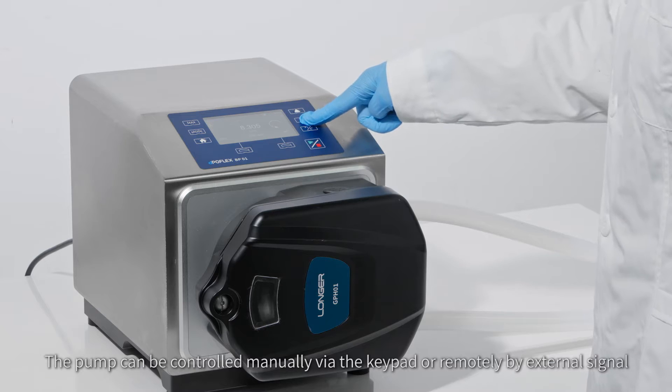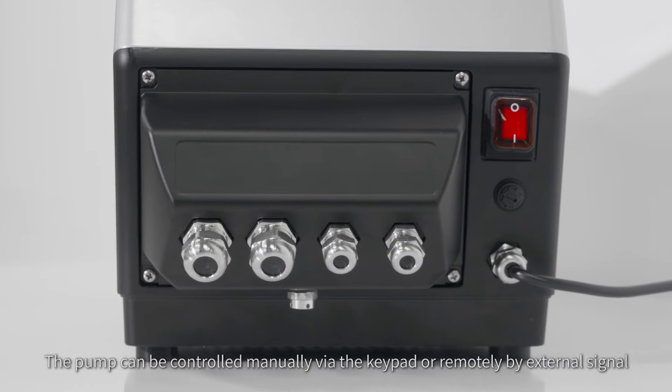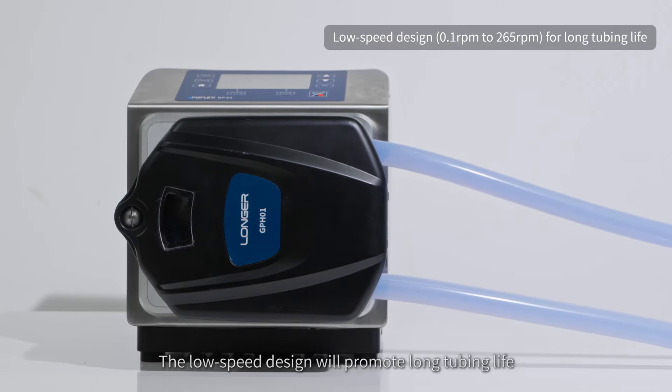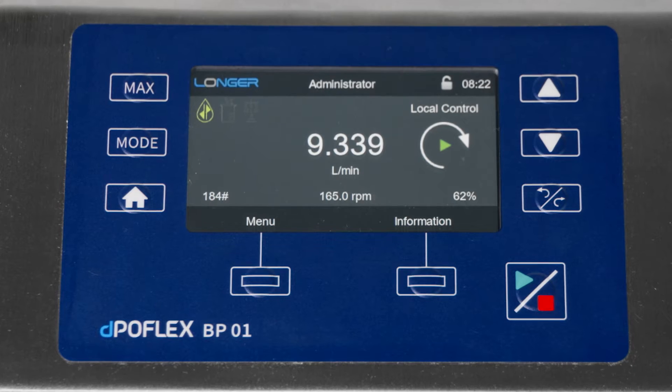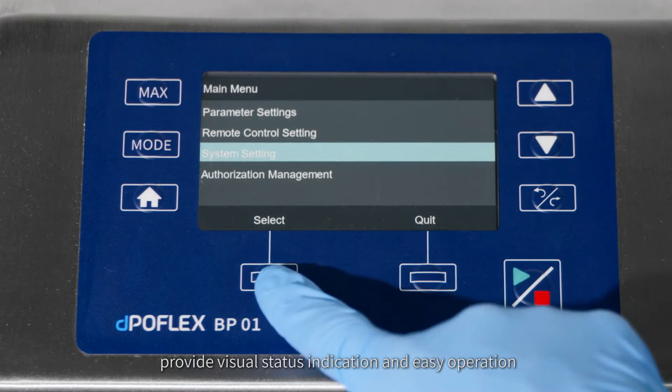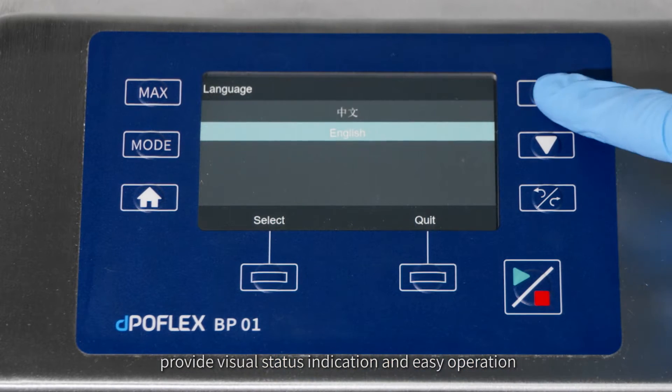The pump can be controlled manually via the keypad or remotely by external signal. The low-speed design promotes long tubing life. The industrial-grade 4.3-inch display and intuitive menu provide visual status indication and easy operation.